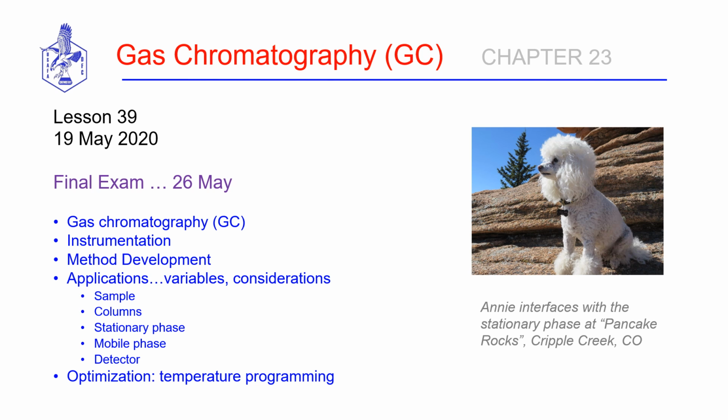Today we're going to discuss gas chromatography, also a very powerful separation tool that is used in countless analysis laboratories across the country. Just an application note: for years, all of the doping analysis done with athletes, the method of choice is gas chromatography interfaced with mass spectrometry.